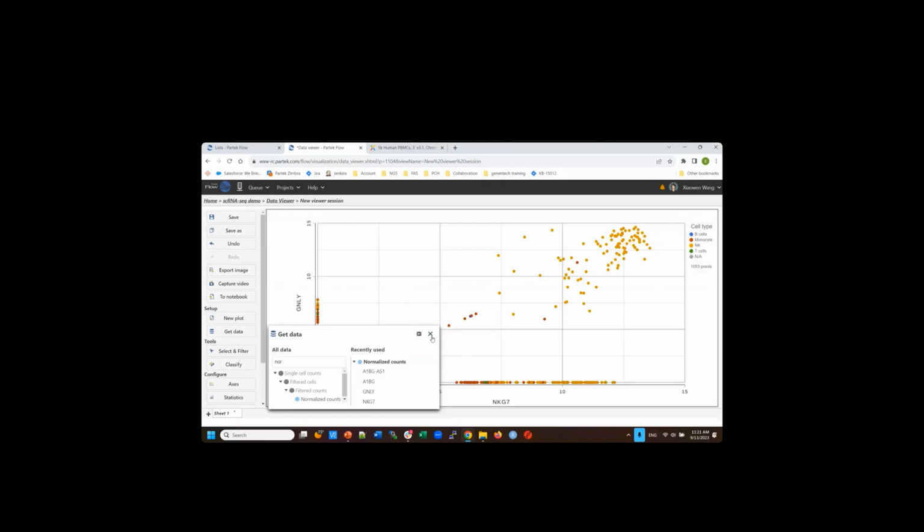And this is a commonly used plot. You want to look at the gene expression, and we can clearly see those cells, they are double positive. And here are single positive cells, and this is 0. Okay, so you can use this kind of plot to make a selection or visualize.